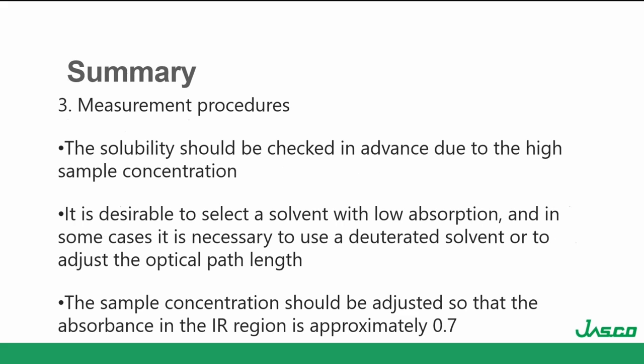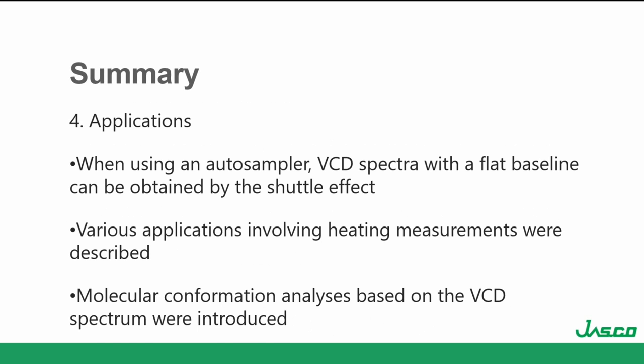Regarding the measurements, some of the parameters that always have to be kept in mind are the solubility of the sample, what solvent is going to be used, and what concentration is to be used. If your solvent absorbs a lot of IR, use a deuterated solvent. Also, we can change the path length of the liquid sample, and at the same time keep in mind that in the IR region the optimal absorbance is 0.7. Finally, we can use the autosampler to reduce the drift in the baseline. There are several applications regarding thermal changes, and molecular conformation analysis can also be done using VCD.